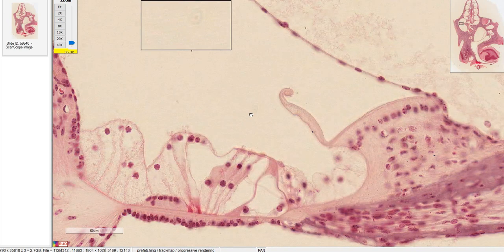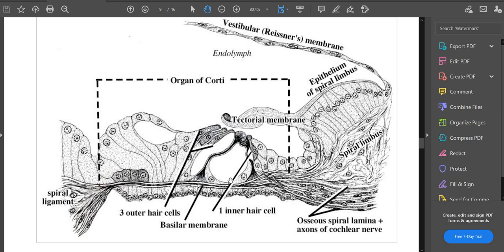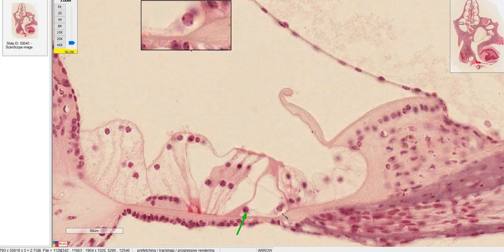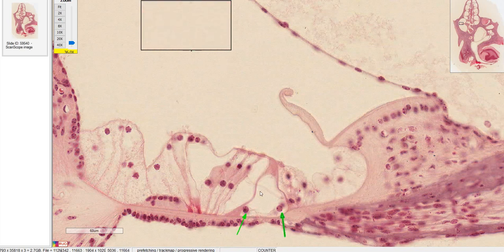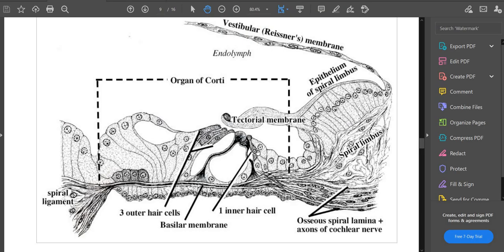Now let's talk about the organ of Corti using the lab manual diagram as a guide. First, these two pillar cells — their cell bodies together form the tunnel of Corti in the middle. On the slide itself, you can see the nuclei of the pillar cells and the tunnel of Corti. Right next to the tunnel of Corti is the inner hair cell, which is probably the most important cell here — it actually responds to its particular frequency and sends its action potential through the axon between the spiral lamina down towards the cochlear nerve.